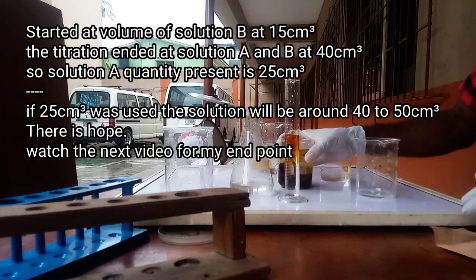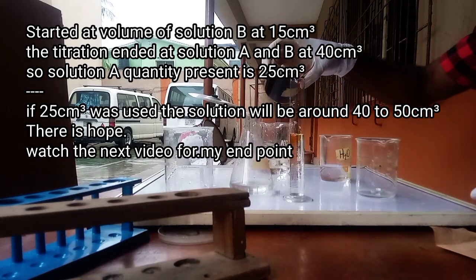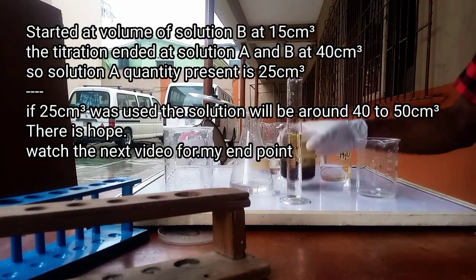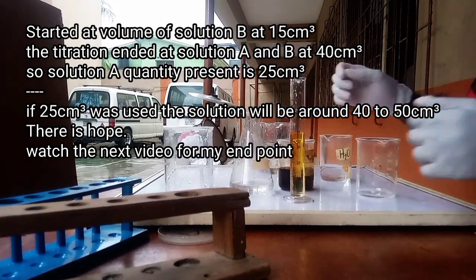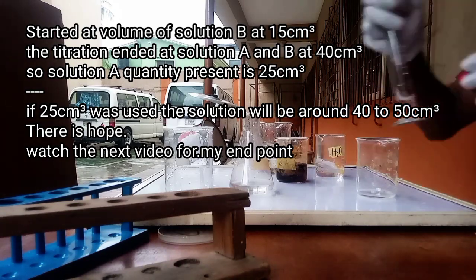I'm going to show you something, and why it is very, very important to practice this along with me. Okay, in this video, I will pause here after this little demonstration. When we come over in the major question and the answer, I am going to show you how to do it. I'm going to titrate it to prove that what I have here as a value is very, very close to the answer. Let me put this in a little bit of fast forward.